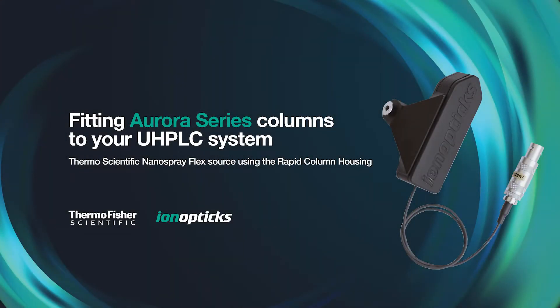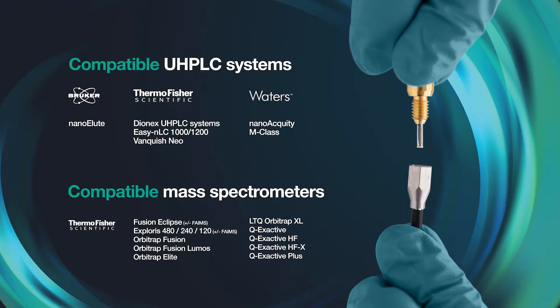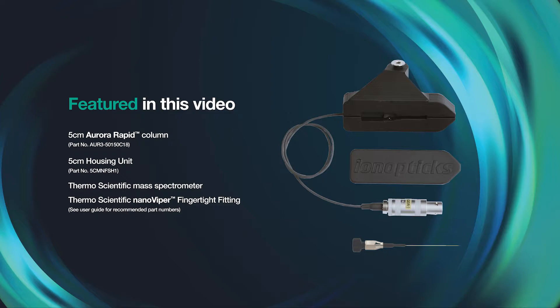This video demonstrates how to fit an Aurora series column to your UHPLC system for the Thermo Scientific nano spray flex source using the 5cm rapid column housing. The following LC-MS platform technologies are compatible with this video. Please refer to our user guide for recommended configurations for each UHPLC system. Listed here are the products featured in this video.